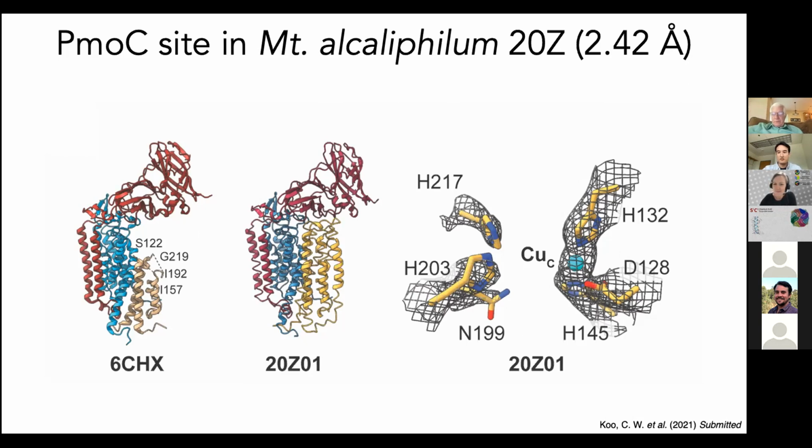Oh, here's one more question. From Amy: do you see the lipid bilayer, the cyanide-treated sample structure, inside that pore? Right, that's an interesting question.